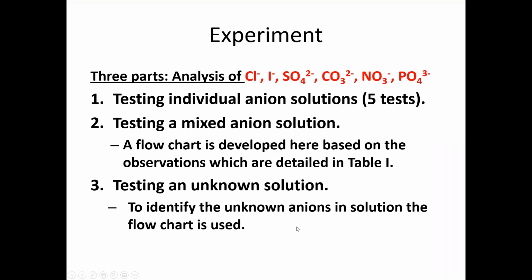You will receive an unknown letter shortly after today's discussion. Based on your unknown letter, you will have different observations, and you need to tell me what ions are in your unknown.